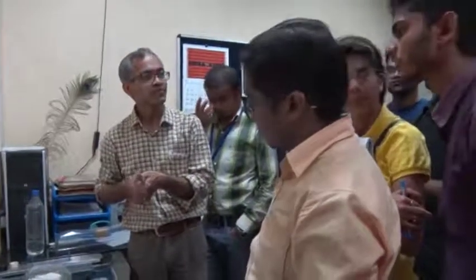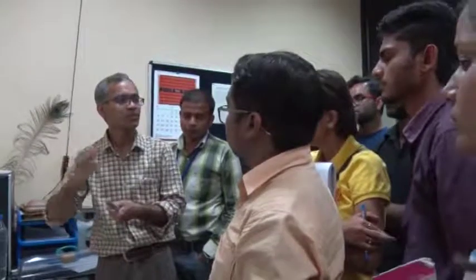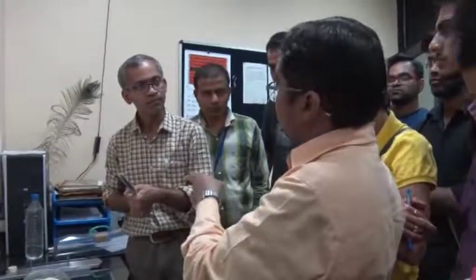So that we can put 4 samples at a time. Pardon? One sample, only one sample, but there are holders which allow multiple samples also, but we don't have them. Okay.